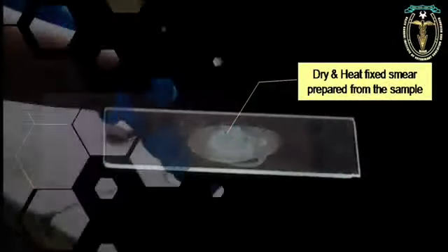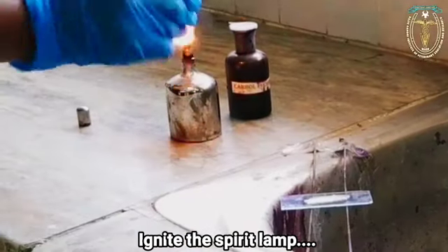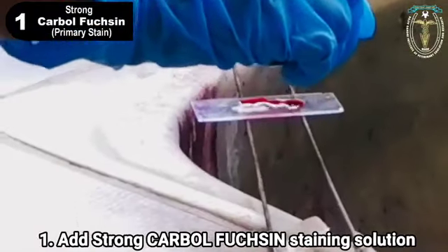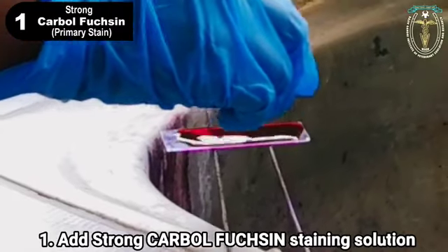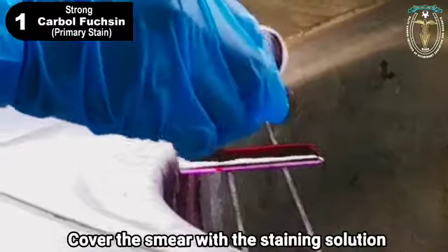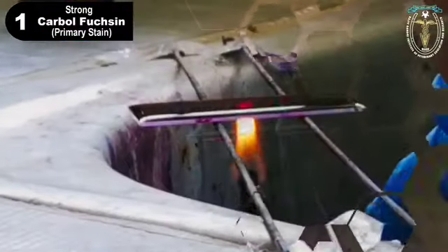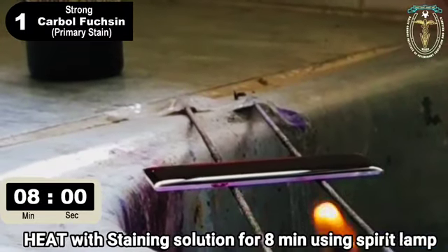After the preparation of the smear, place the fixed smear on the staining rack. Then, ignite the spirit lamp. First, add the strong carbolfuchsin staining solution over the smear. Cover the entire smear with the staining solution. Heat the stain until vapor just begins to rise. Do not overheat.